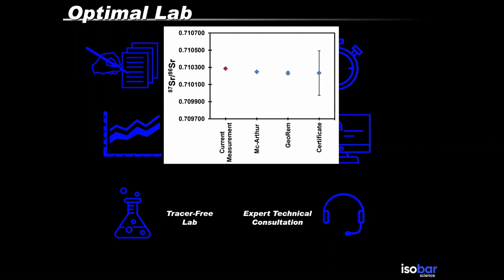Right, this here is a final graph I'm going to show you. This is an example of how we provide the information regarding the standard analysis and error propagation. Here is our current analysis on strontium isotopes. This is our current measurement compared to the MacArthur values and the GeoRem values, which is a compilation of all the strontium analyses done on strontium standard 987.